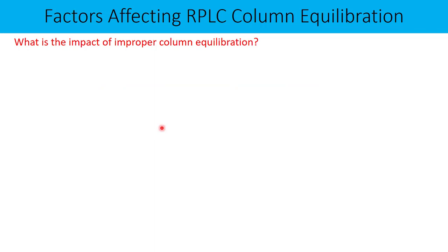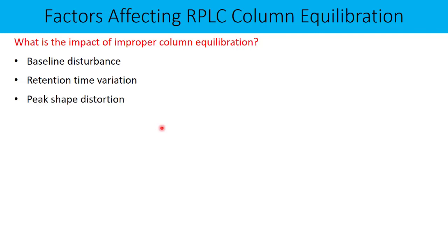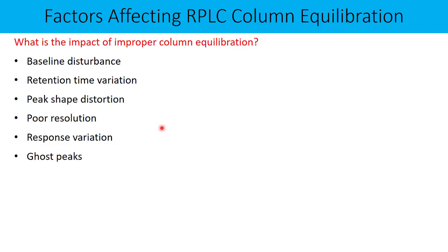Now, what is the impact of improper column equilibration? Baseline disturbance, retention time variation, and peak shape distortion can all result from improper column equilibration. Your resolution may be poor, and your response can also vary. In addition, your pressure gets fluctuated, and you may also end up getting ghost peaks or spikes in the chromatographic run.